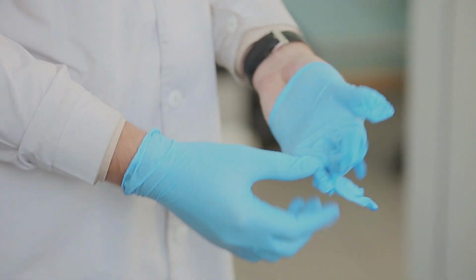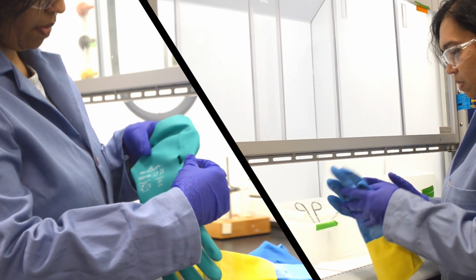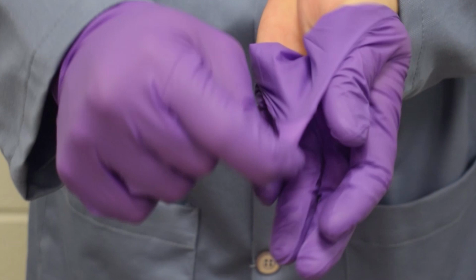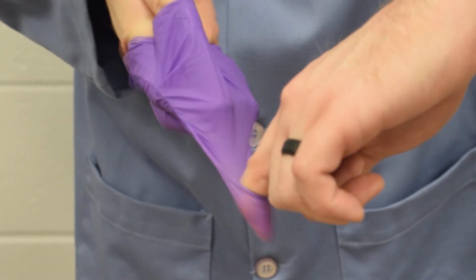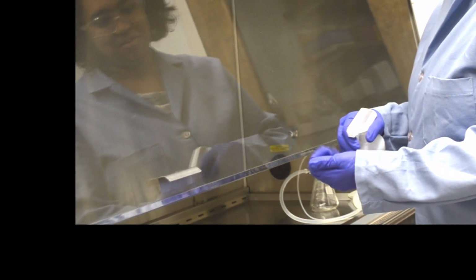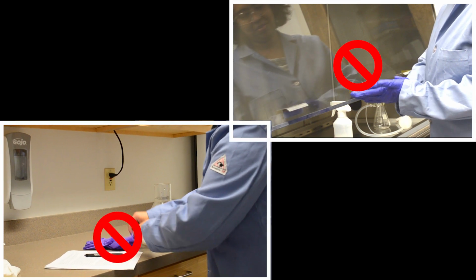Make sure to wear gloves that fit you properly. Inspect gloves for rips and tears before every use. Remove and replace disposable gloves immediately when a chemical spills or splashes on them. Do not spray your hands with alcohol. Doing so breaks down the glove material, leaving you more susceptible to any spills or accidents that may occur. Never wash or reuse disposable gloves.